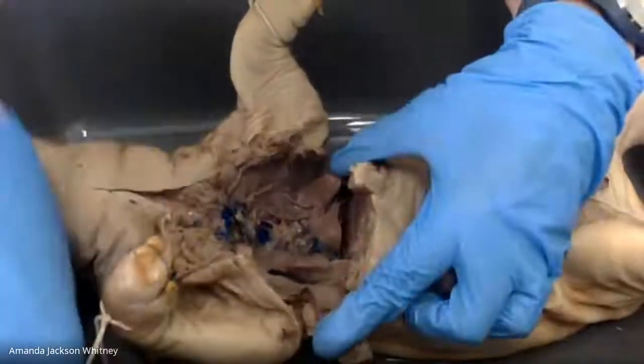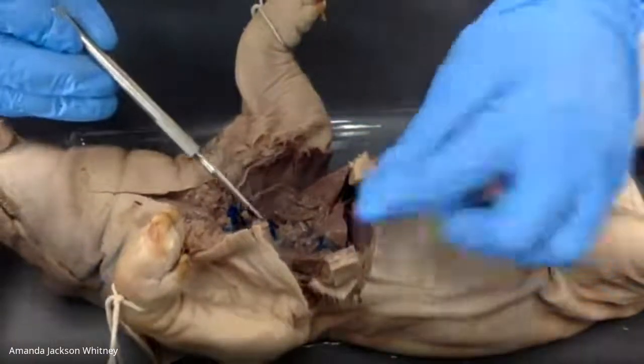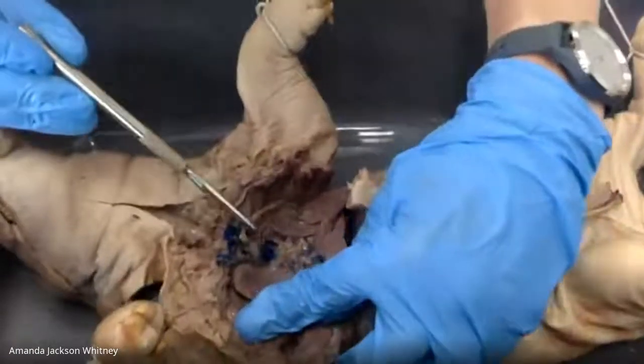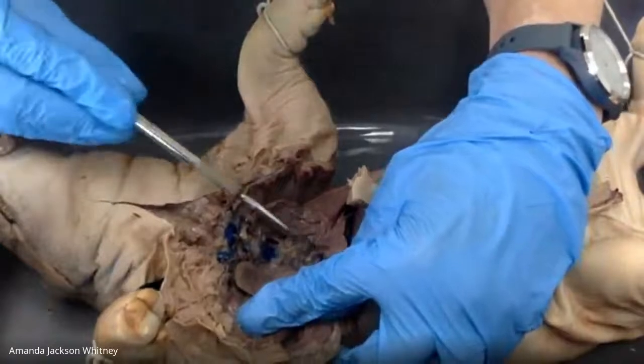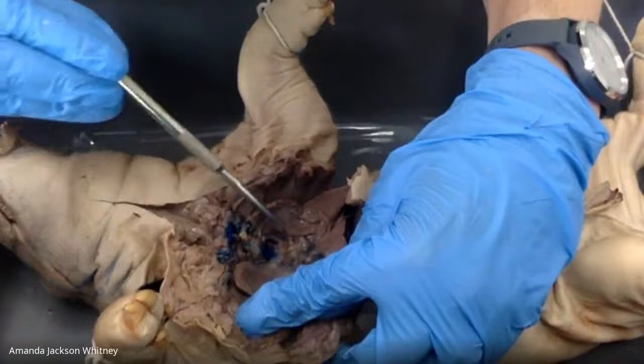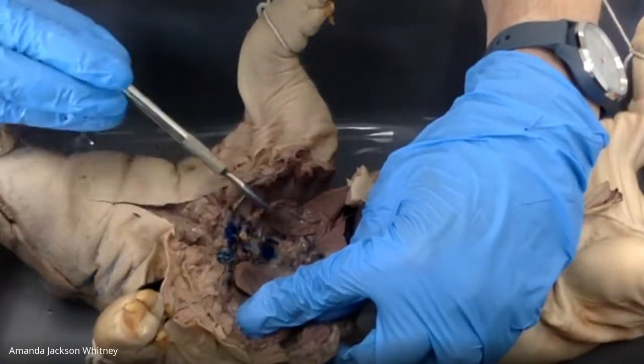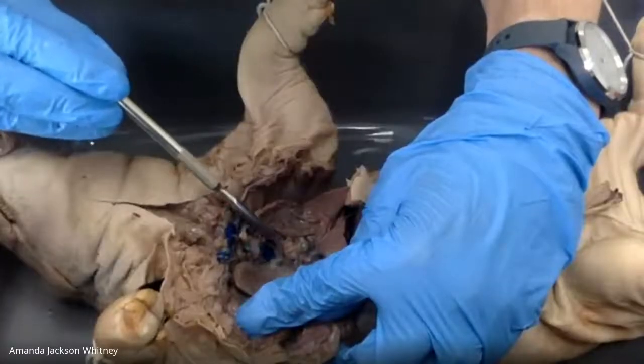So this is actually a pretty good shot. I might have to take a picture of this. I just cut the heart out, which we'll dissect in just a second. But here we can see some of the main blood vessels that are bringing blood back towards the heart. But then do you see these little blue dots here? Yeah, these are actually the pulmonary blood vessels.